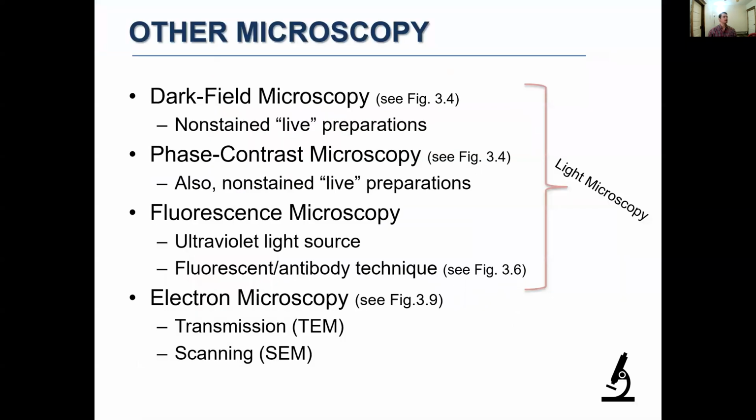Okay. So all of that, what we just discussed, all deals with bright field microscopy. Looking now, there are other types of microscopy that also rely on light. So they have similar principles that apply.